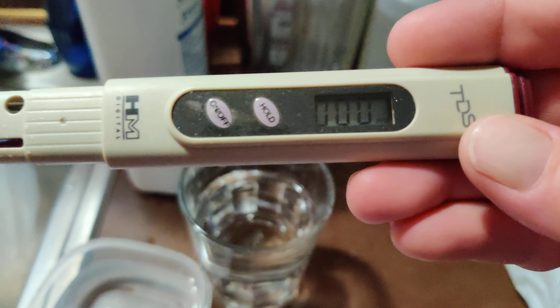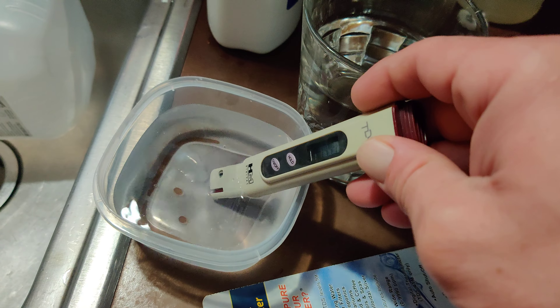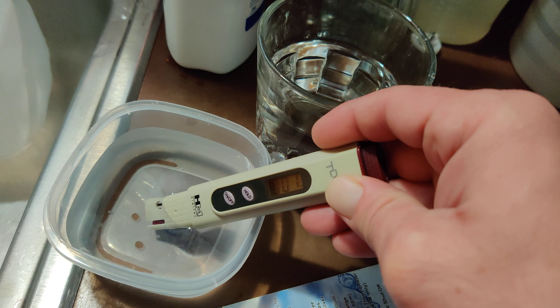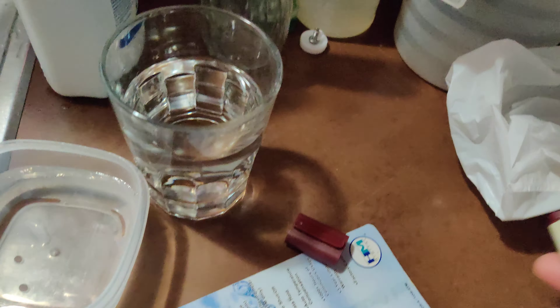See it's at zero. Put it in the water. That ain't too bad — that's only 22, 23. Click it off, it's back at zero.